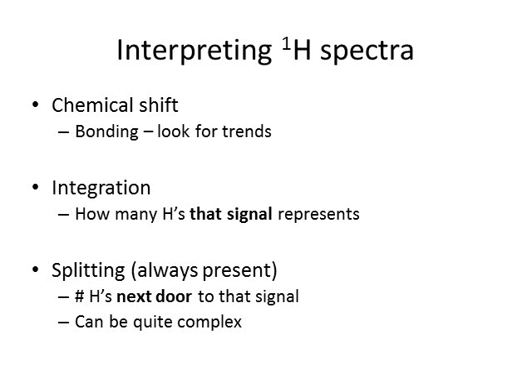Again, last time we noted that there are three sorts of things in proton NMR that are information-bearing. That is chemical shift. The hydrogen bonding environment, different bonding environments will lead to different arrangements of electrons, which will lead to different energies for this whole excitation-relaxation process, which means that these different environments will lead to different signals along the x-axis.